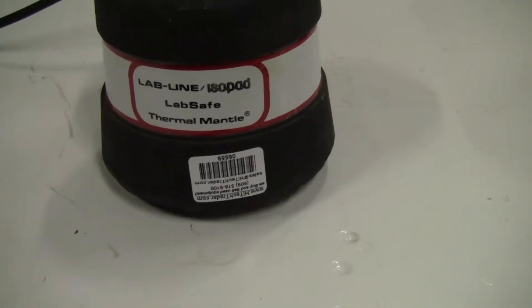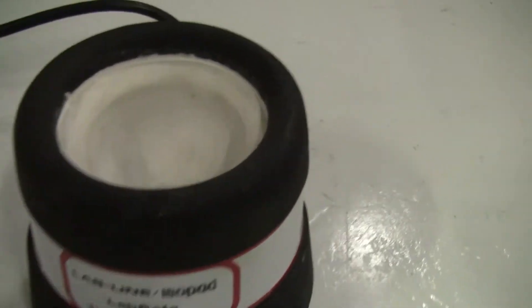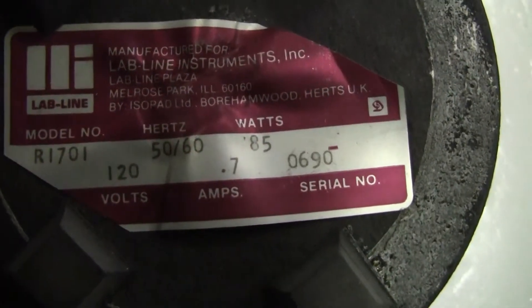Hi, this is Jim from HitechTrader. We're looking at a LabLine Isopad heating mantle. It has a ceramic inside and a drain. This model is R1701.